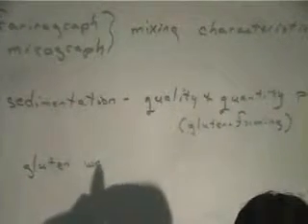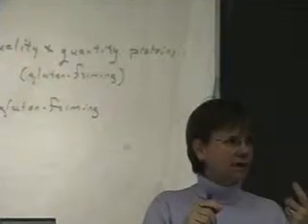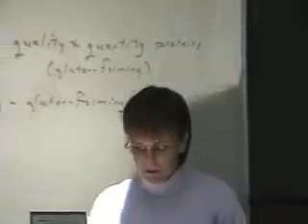Gluten washing, whether you're doing the gluten index, either by machine or by hand. What kind of information are you trying to get? The gluten-forming proteins only. So we can get the percentages that give us something about the quantity of protein that's in there. And by the feel, or by the centrifuge to get gluten index, we can get quality.